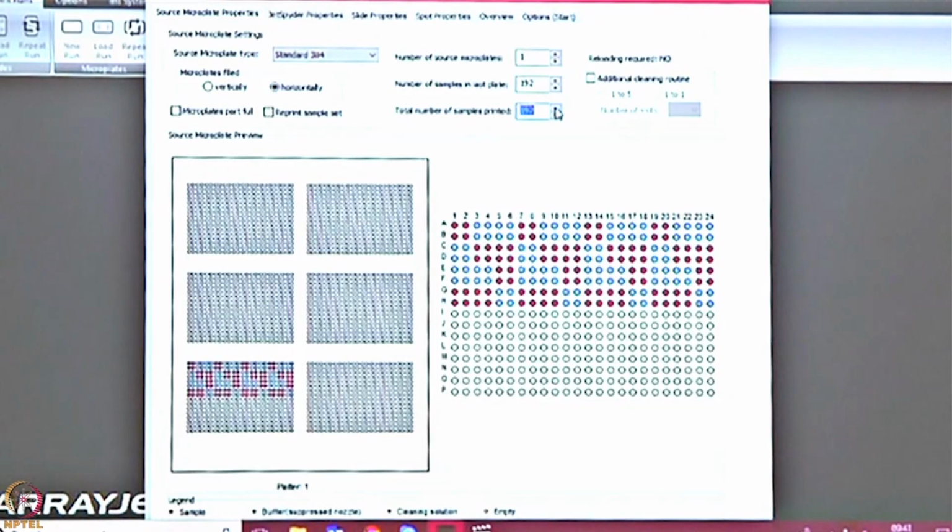So it's so flexible. Because there are so many different applications, it's actually a very interesting question, and I'll spend another 2 hours telling you how we are doing this mechanism of generating the well plate. So the jet spider needs to fill up one corner of 12. Because it's in multiples of 12, it has to finish the first 12, go to the next 12 wells, go to the bottom 12 wells, go to the next bottom 12 wells. It has to finish one section before it moves printing and takes another set of 12 samples.